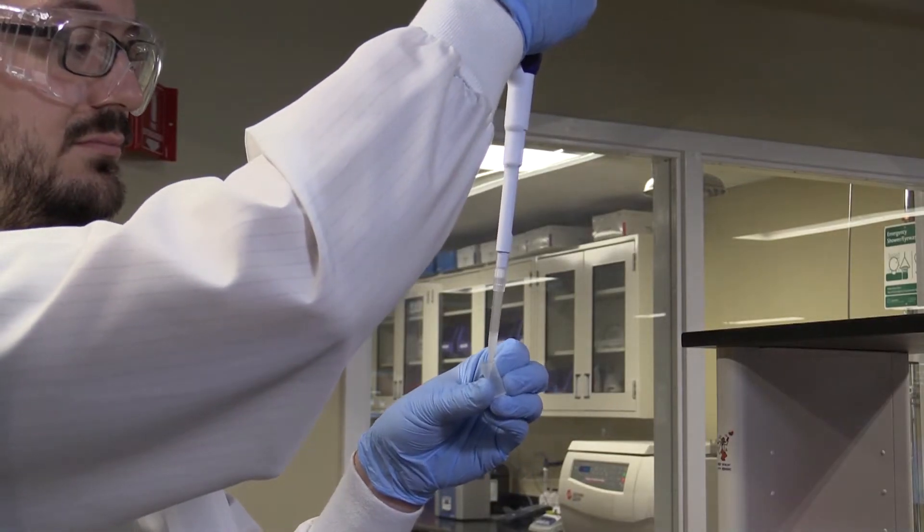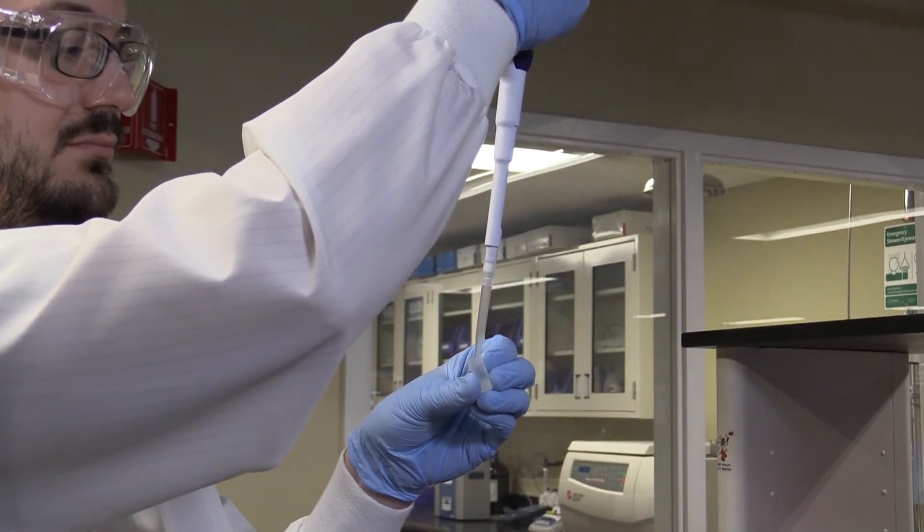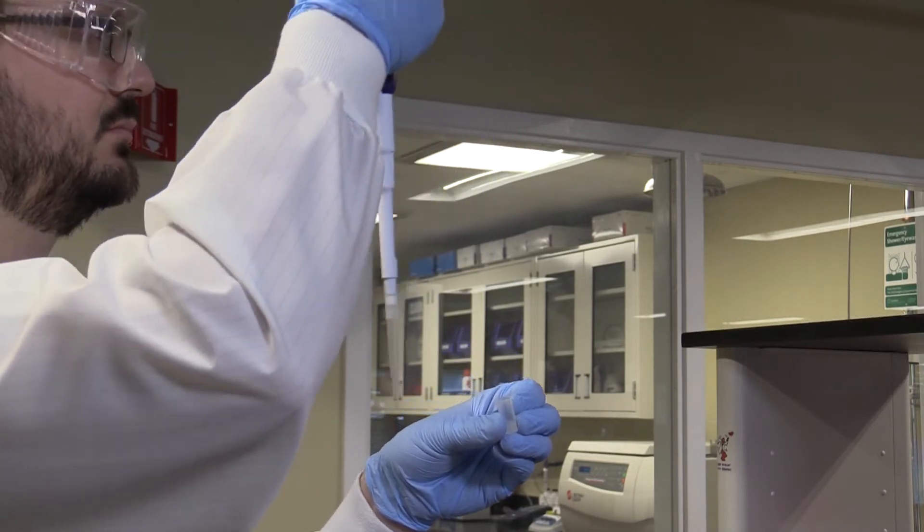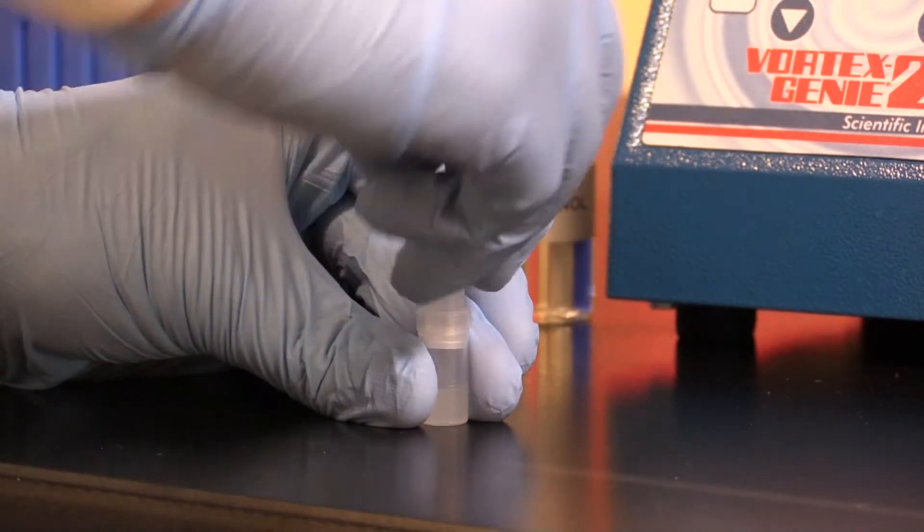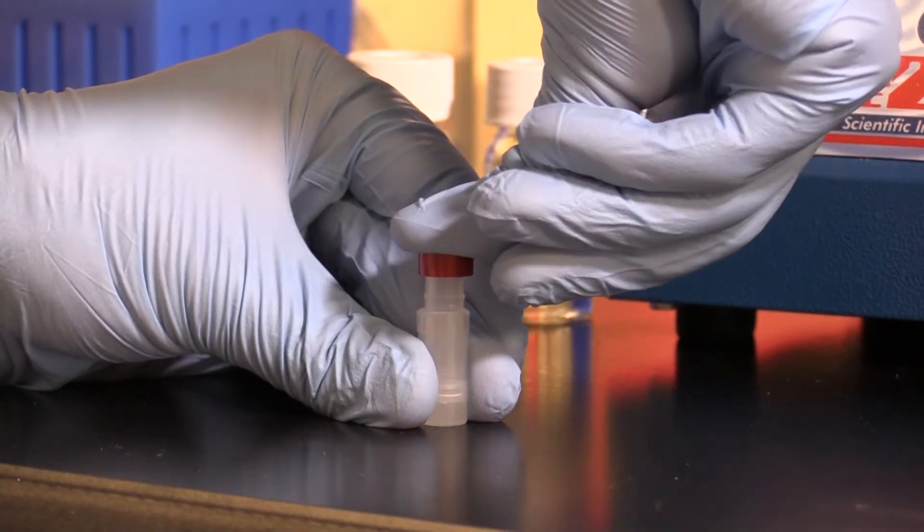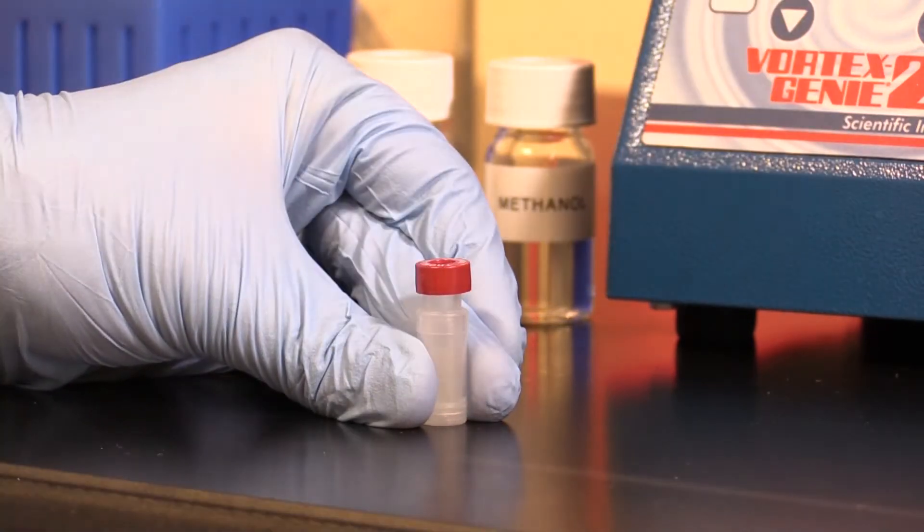Place 400 microliters of the sample extract into a Thompson single-step filter vial. Then place the plunger inside the filter vial and depress it to filter the sample extract. This allows the sample extract to pass through the membrane, filtering out particulates.